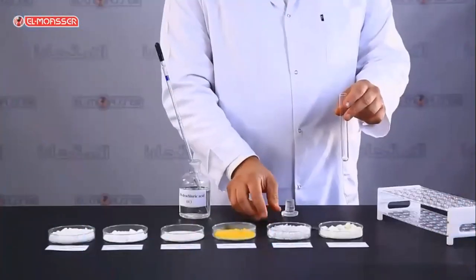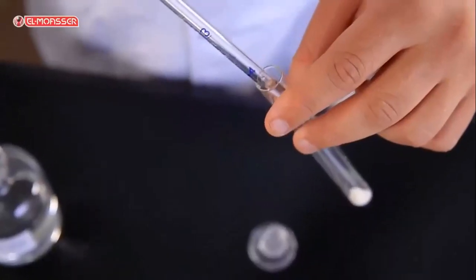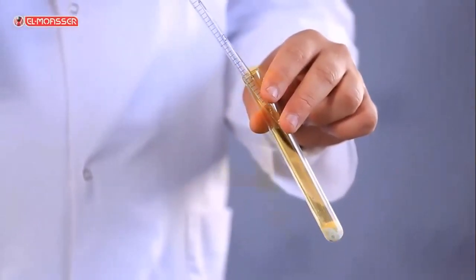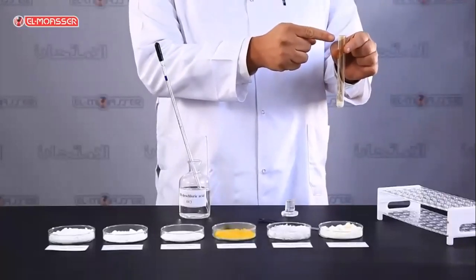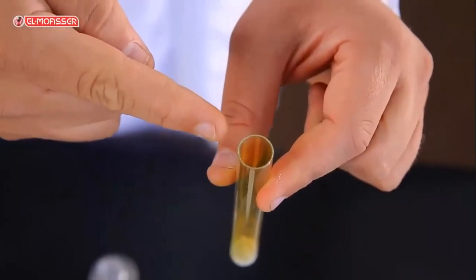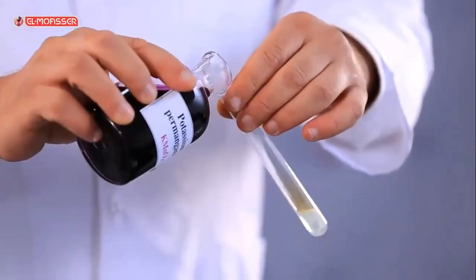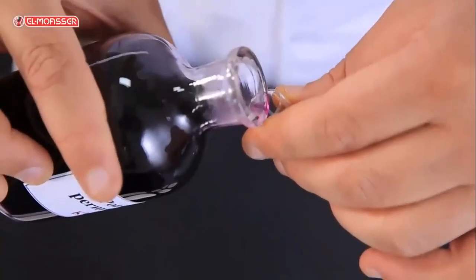Summary. On adding drops of diluted hydrochloric acid to sodium nitrite salt, a colorless nitric oxide gas evolves and changes into reddish brown gas at the mouth of the tube. On adding acidified potassium permanganate to sodium nitrite solution, the violet color disappears.